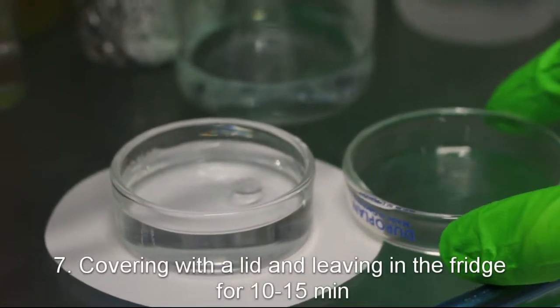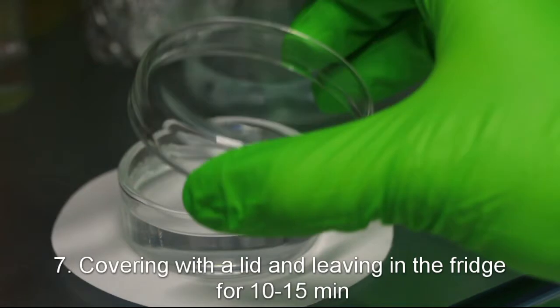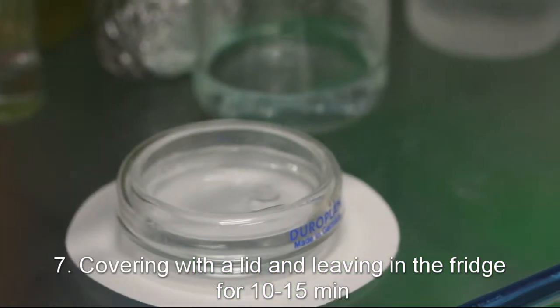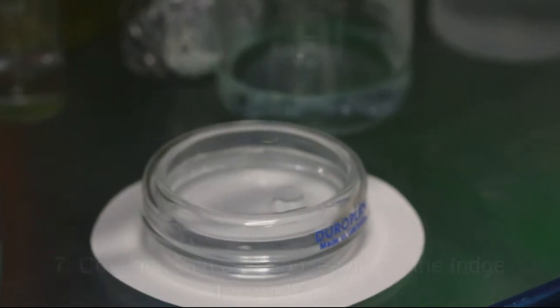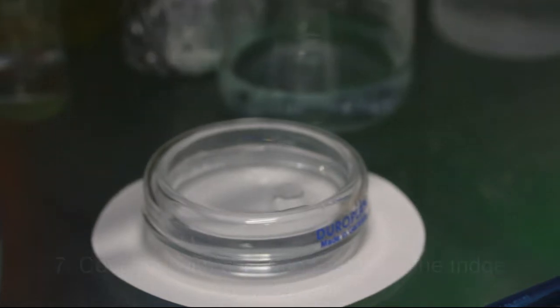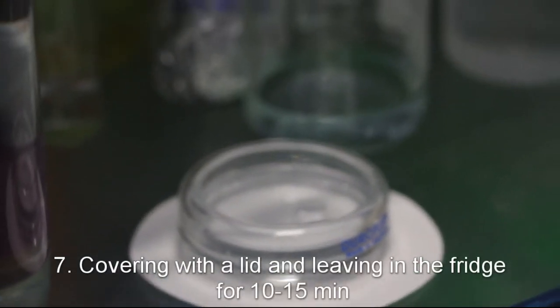After the ammonium persulfate solution is substituted with pure water, we cover it with a lid again and leave in the fridge for another 10-15 minutes. It's very important to leave it in cold again, because the cyclohexane might have partially melted during the water substitution and having the fridge open during that. 10 minutes in cold will allow it to freeze again.